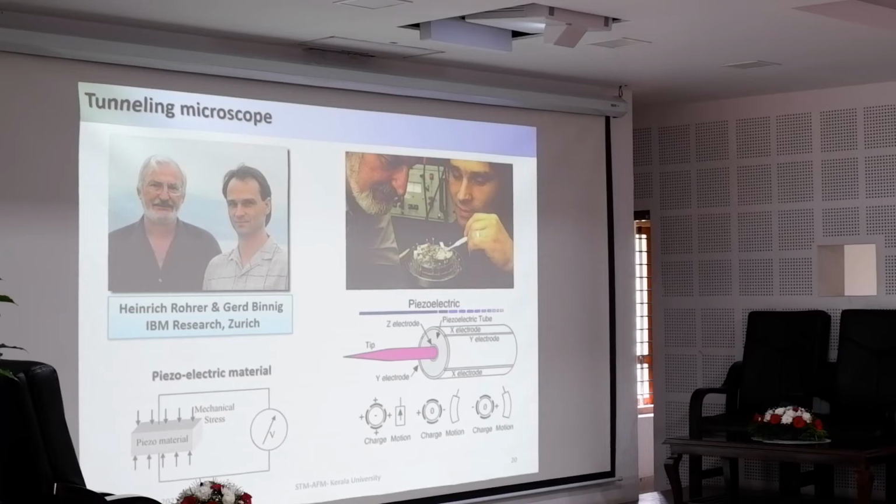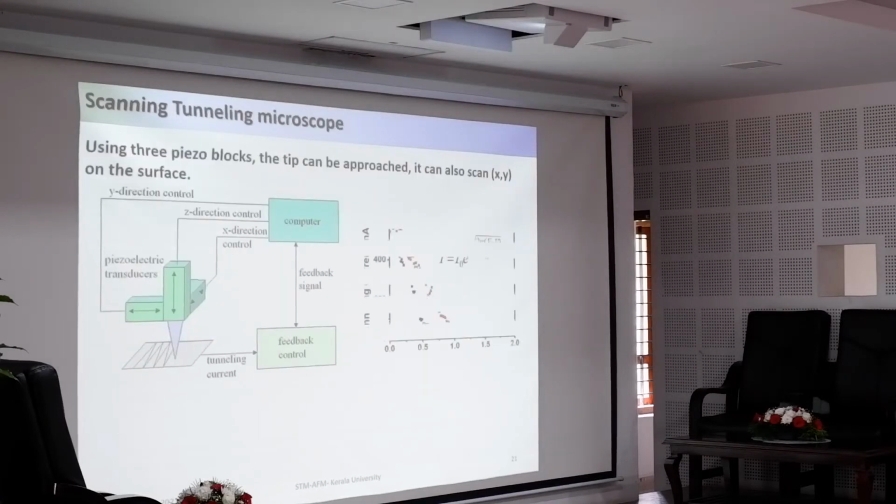Okay, and how do we know? What we should do then is to scan very slowly. Okay, I will tell that at that time. I have some diagrams about that. So this is basically how it works. I will go quickly because our time is almost up.